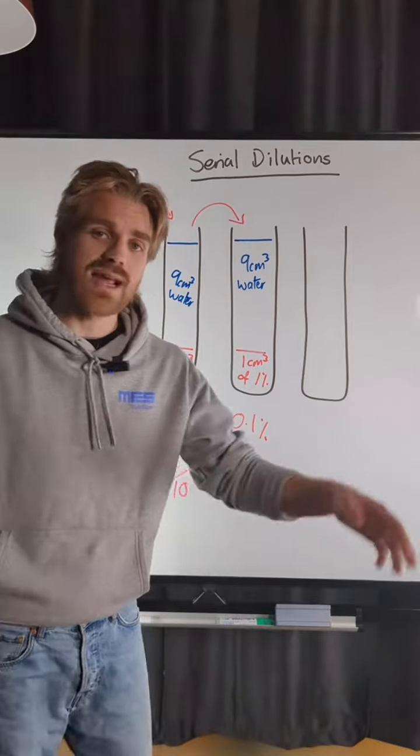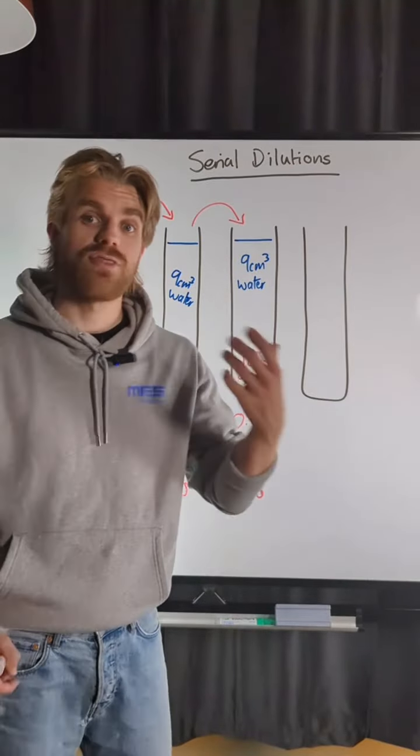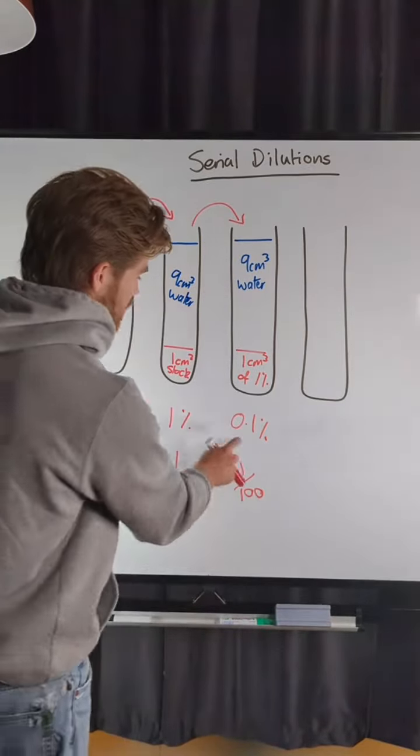Let's go a step further. Let's now go for a 1 in 1,000 dilution. So we're going to go 10 times more dilution.